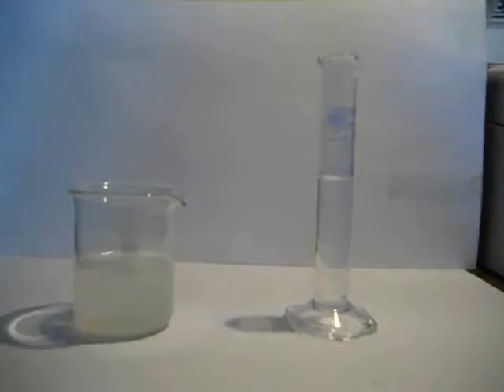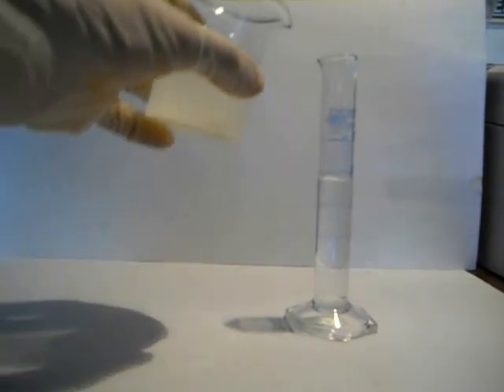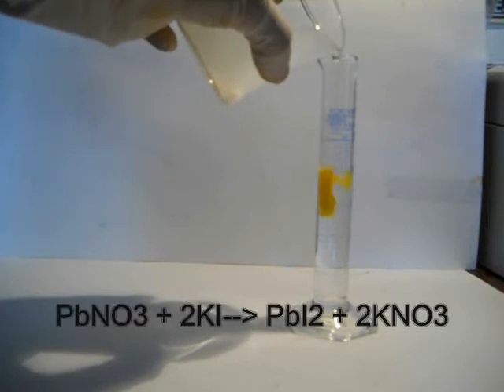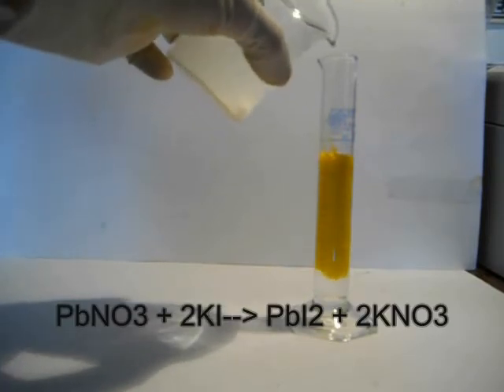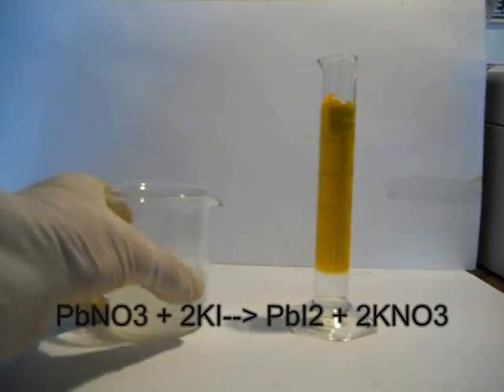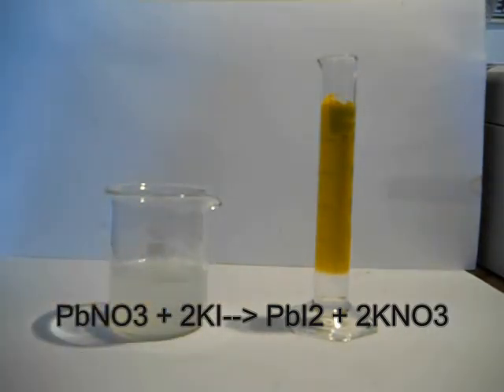Once done, add the lead solution to the other one. A precipitate of lead iodide forms instantly. Here is the reaction: lead nitrate reacts with 2 moles of potassium iodide to give lead iodide and 2 moles of potassium nitrate.